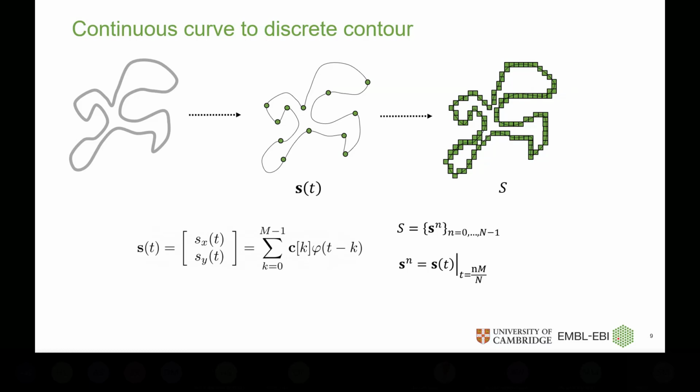Since we have this continuous description, we have to obtain a discrete representation out of this continuous representation. Since we have this unique advantage of our shape model being continuous, we can sample it at any arbitrary precision, and we are able to do it in a differentiable manner to perform backpropagation on it, which is pretty cool.